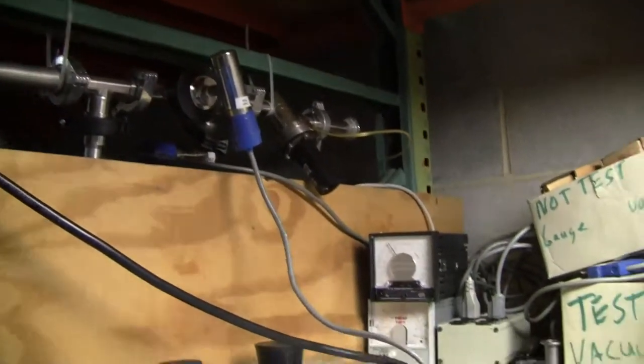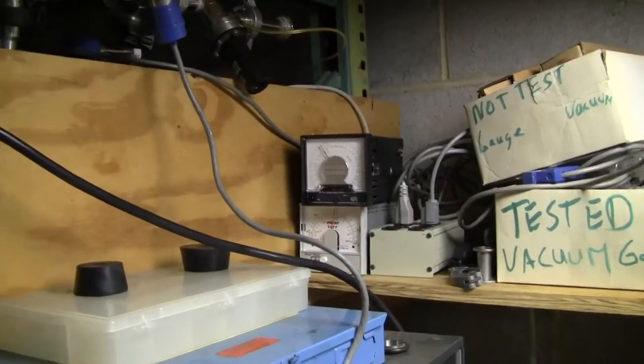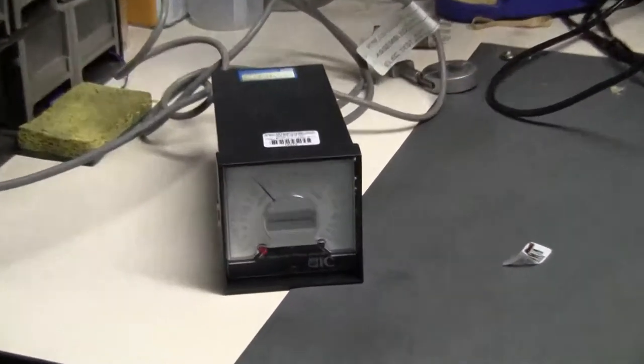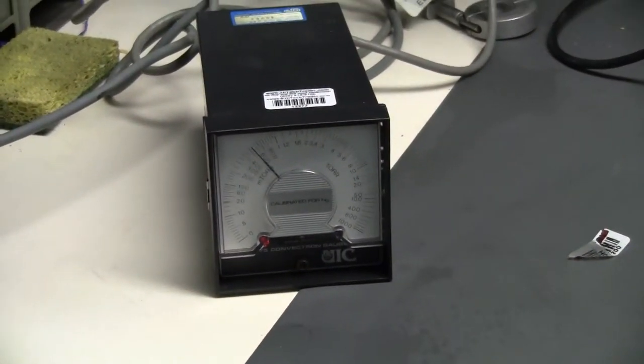This particular unit does not come with the cable, nor does it come with the actual gauge. However, it is performing as it should at the right vacuum level. If you have any further questions, please don't hesitate to call 609-518-9100. Thank you from HiTechTrader.com.